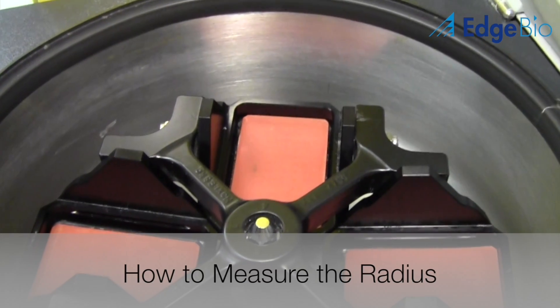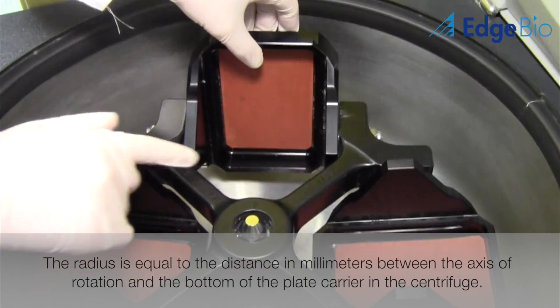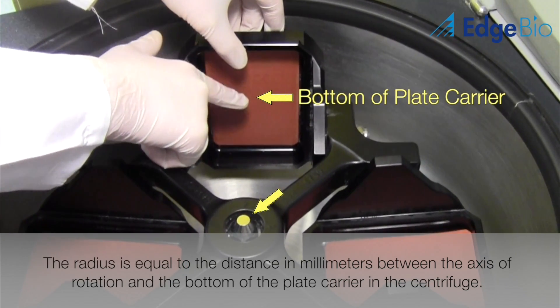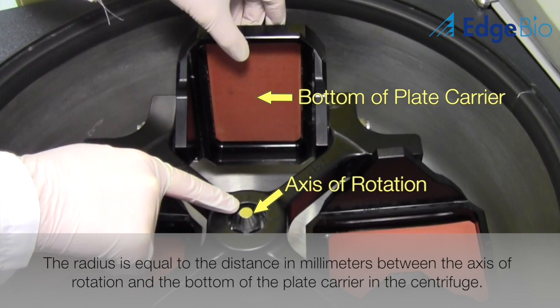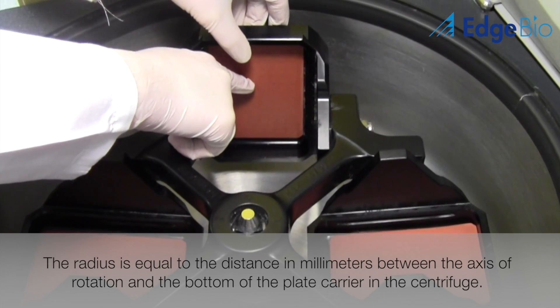First, we will show you how to measure the radius of your centrifuge. The radius is measured by calculating the distance between your axis of rotation and the bottom of the plate carrier. It's important to note that the measurement should be taken from the center of the plate carrier base. The plate carrier should also be lifted to a 90 degree angle to replicate the position it would be in during centrifugation.